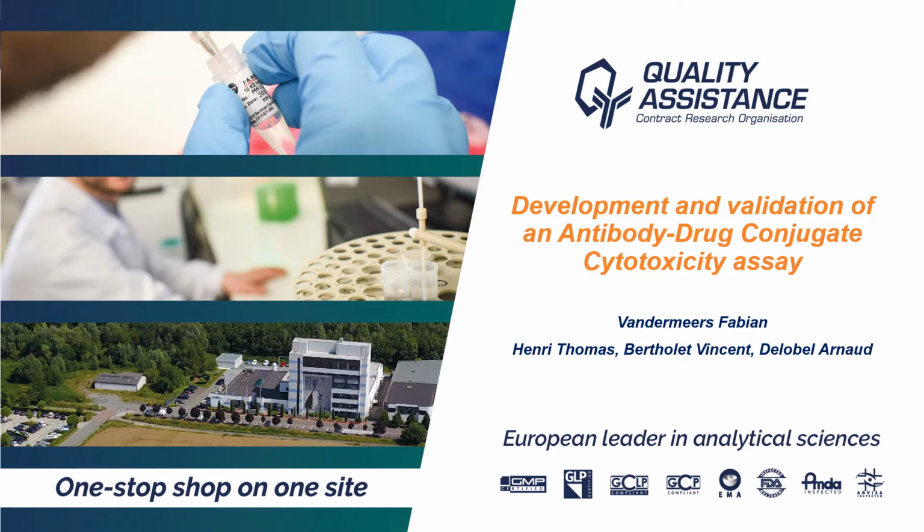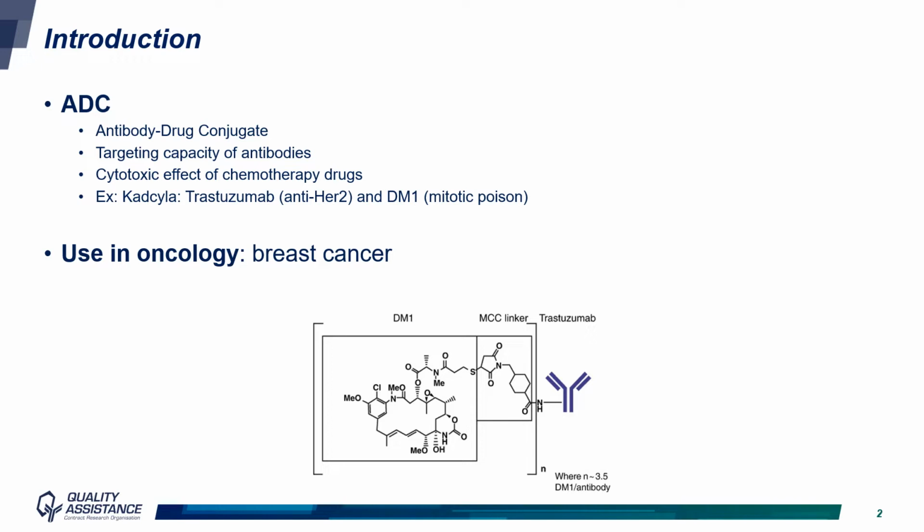Today I'm going to present data on the development and validation of an antibody-drug conjugate cytotoxicity assay. Antibody-drug conjugates, or ADCs, are a class of drugs used in the treatment of different cancers. Unlike chemotherapy, ADCs are designed to only target and kill tumor cells.